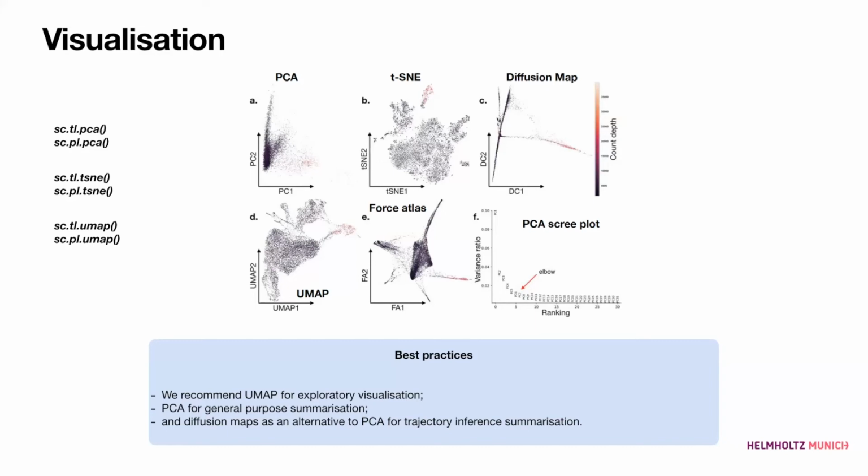So it inherently needs to overemphasize or underrepresent certain types of distances in your data. That's just the way it is. So any quantitative results should always be based on the actual data and not just on the UMAP. But granted this, it's a very useful tool to look at your data and get a feeling for how, for example, individual cell clusters relate.